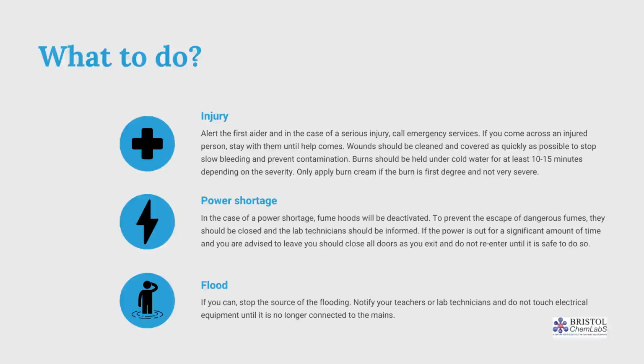In the case of a power shortage, fume hoods will be deactivated. To prevent the escape of dangerous fumes, they should be closed and the lab technicians should be informed. If the power is out for a significant amount of time and you are advised to leave, you should close all doors as you exit. Do not re-enter until it is safe to do so.